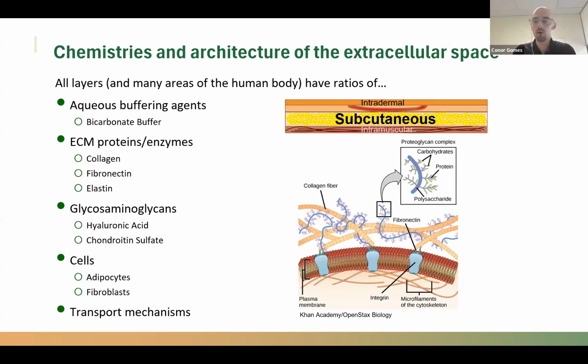What it does is you lower the pore size, so the diffusivity decreases. So you slow everything. You have more of the chemical interactions happening within the cartridge, and by the time you get release, all those interactions happen more as a chromatographic method by the time it reaches that membrane before release. So that's my immediate answer.